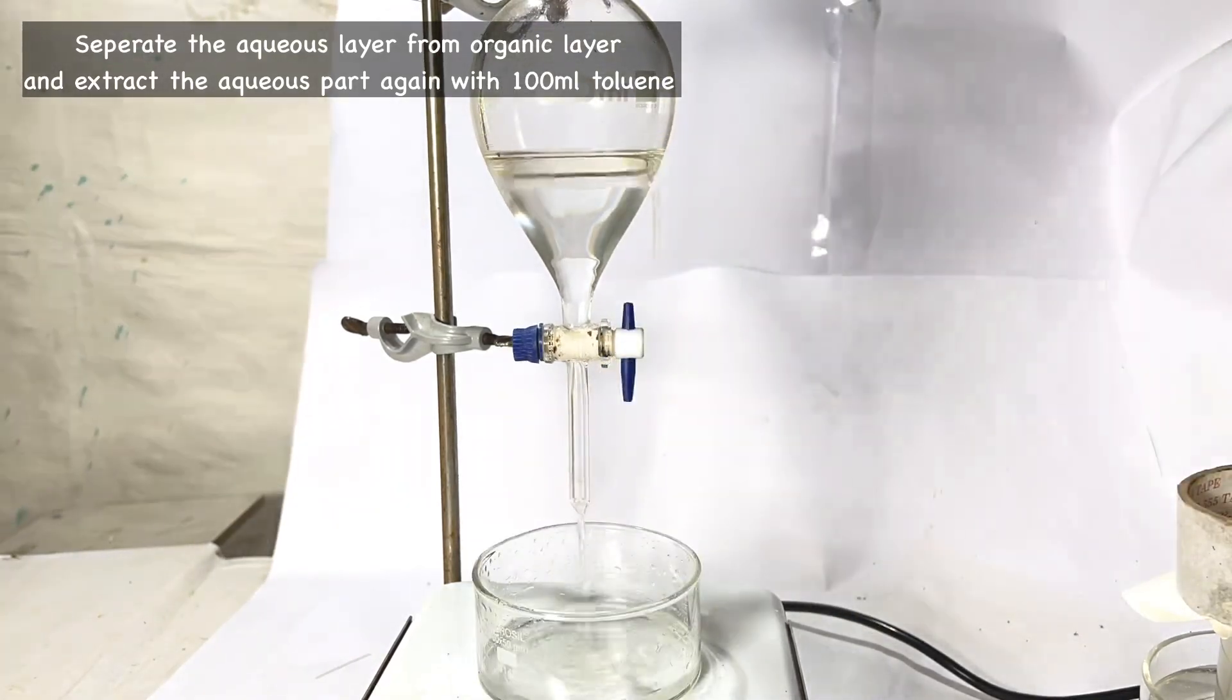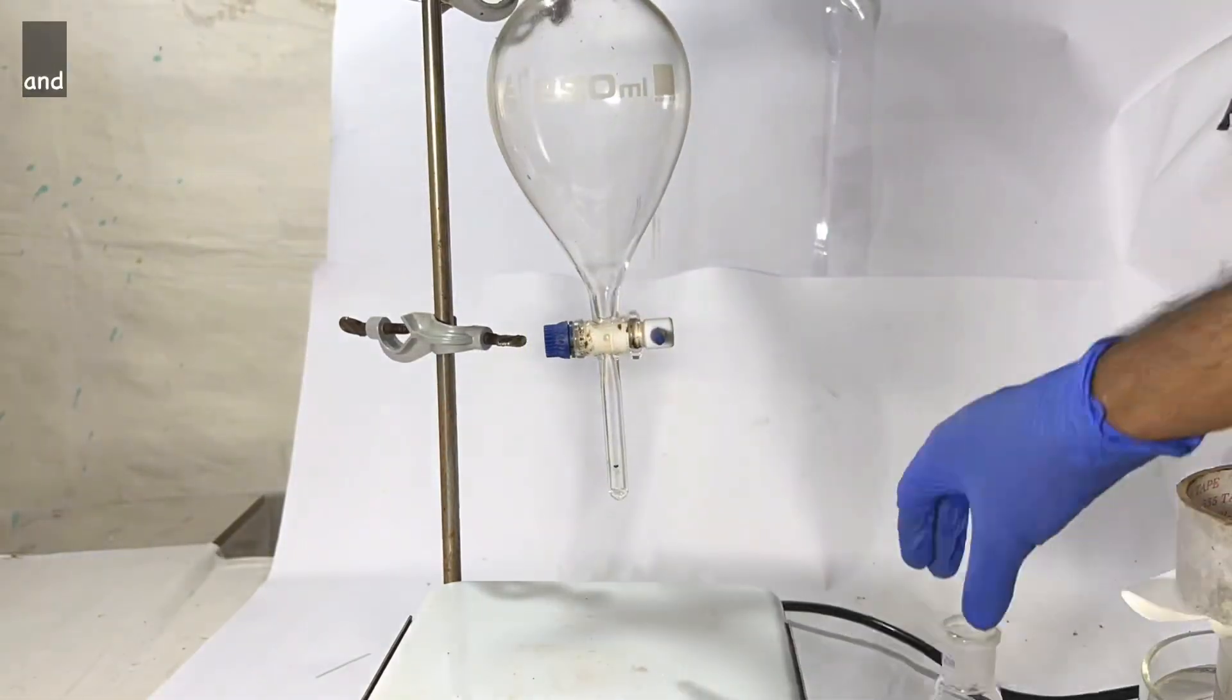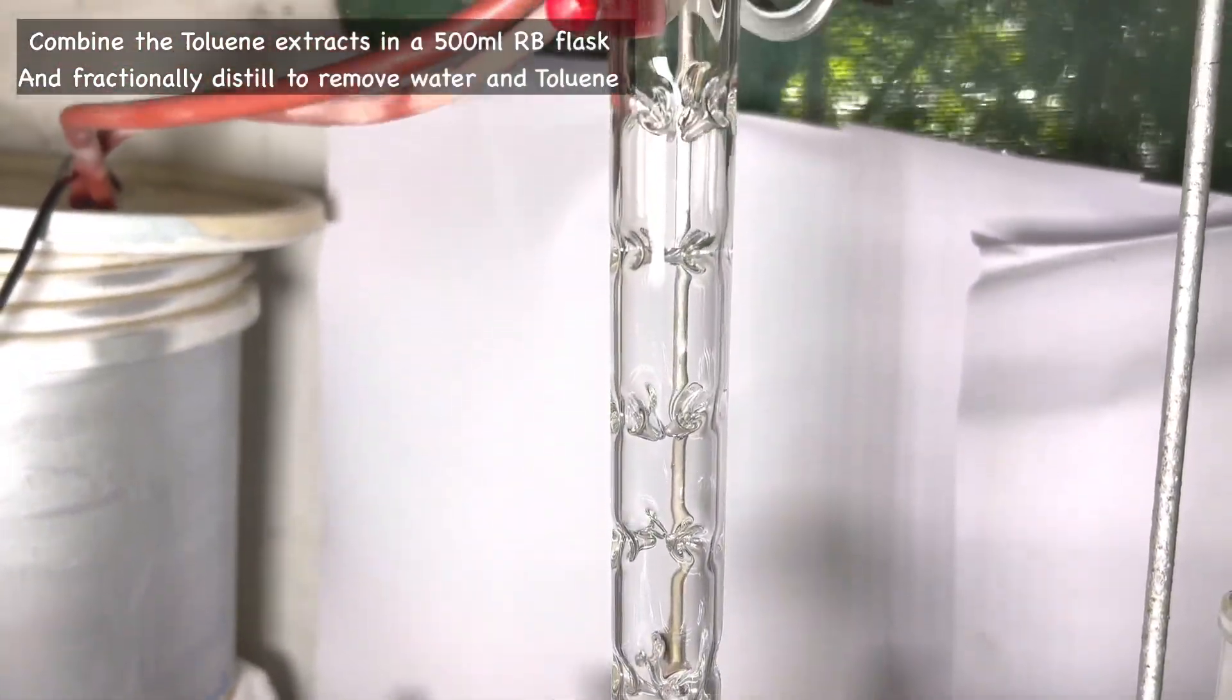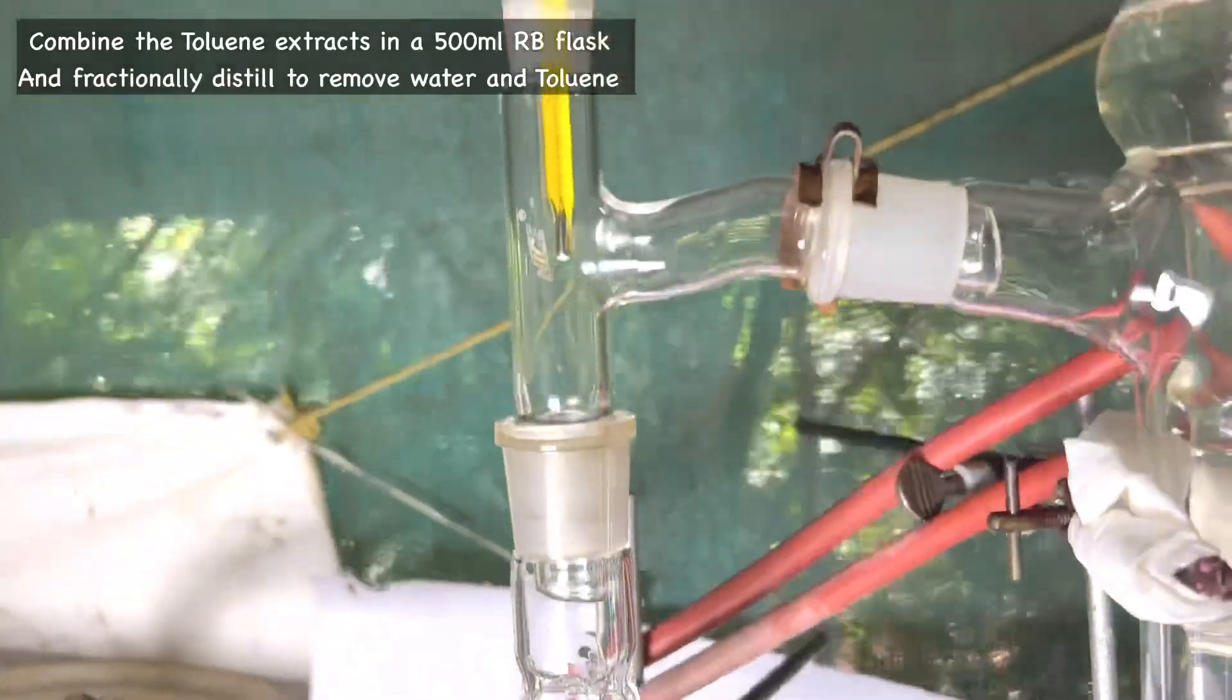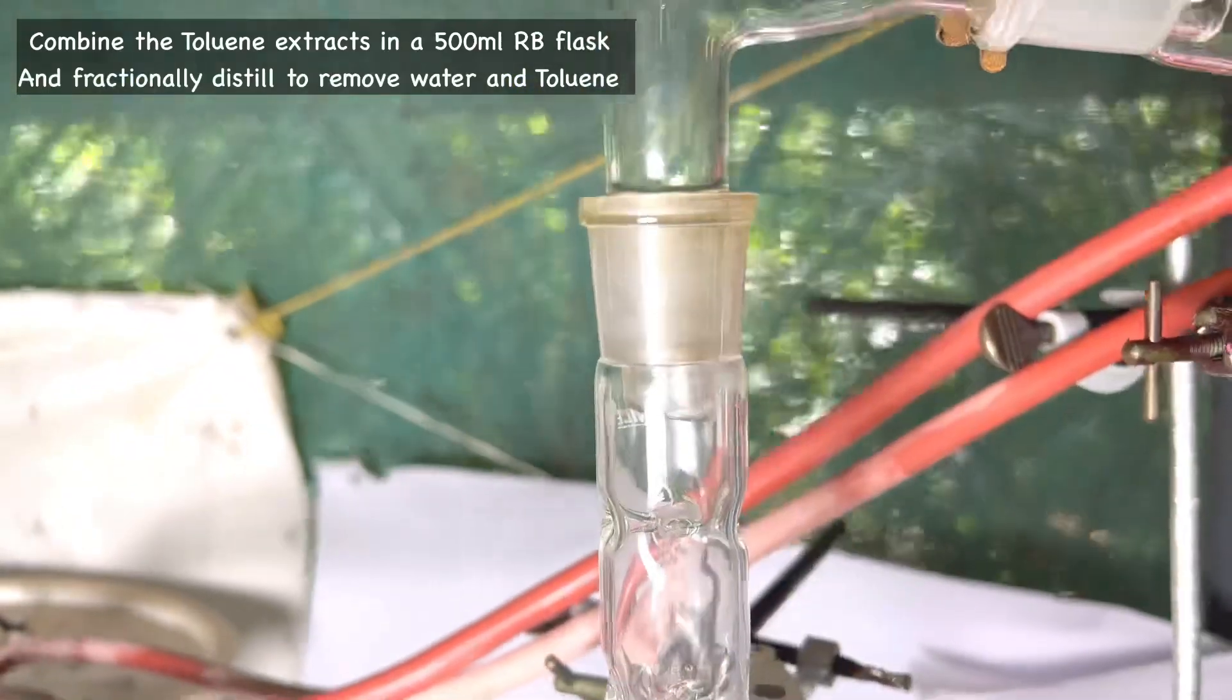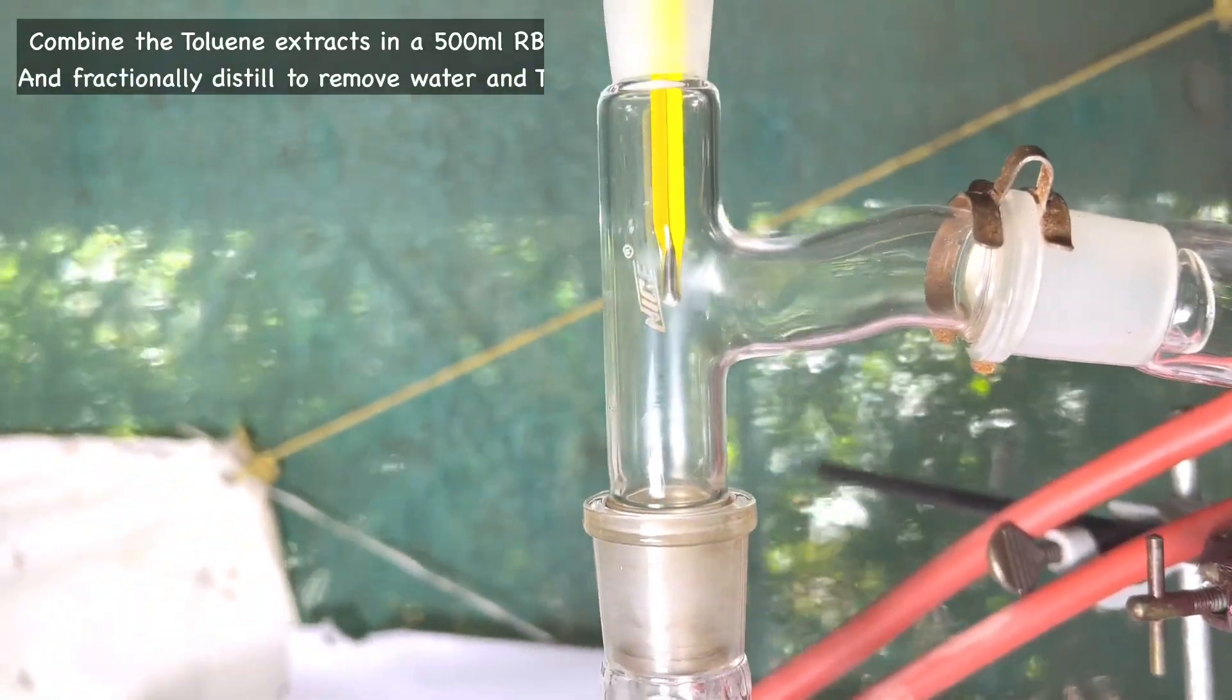Finally, the toluene extract was arranged for fractional distillation in order to recover the solvent toluene. The boiling point of toluene is 110 degrees Celsius and it tends to form an azeotrope with water if simple distillation was carried out.